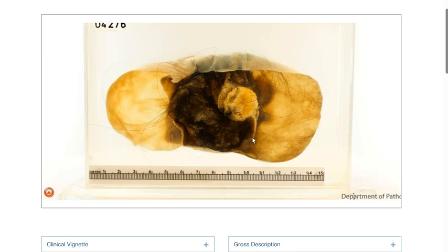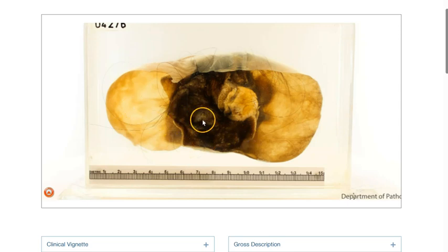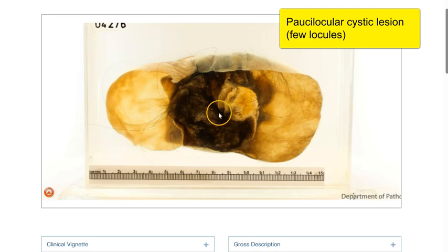Moving back to the cut surface, this is comprised of three locules, and therefore this is a paucilocular cystic lesion.